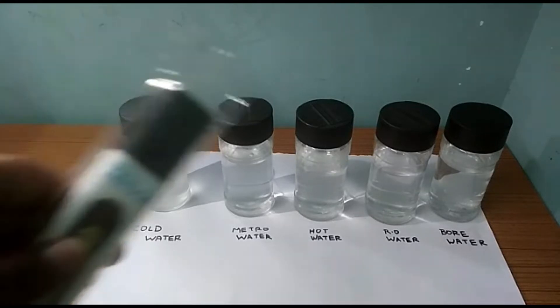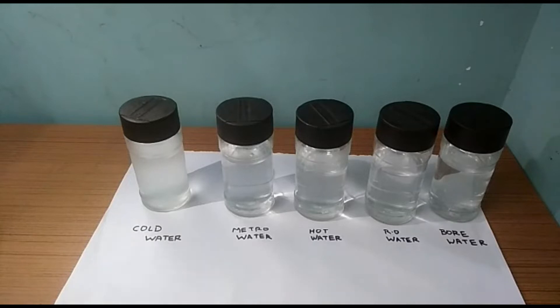Okay guys, now we will use the TDS meter. TDS stands for totally dissolved solids.